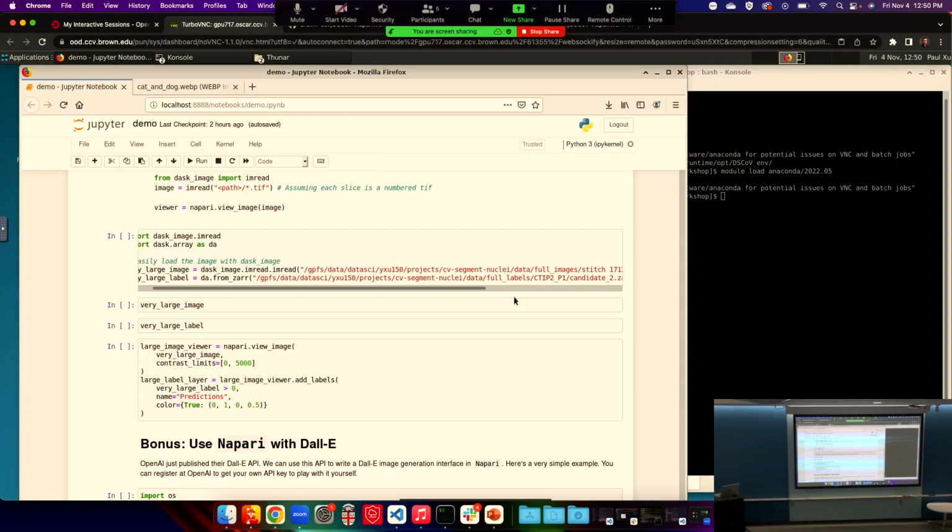Just because you clicked on the GUI to eliminate that viewer, is all the data that was in it now lost, or does it still exist as a Python object if you want to grab something you forgot? I think it is lost, but let me just check. We can see if the viewer is still there.